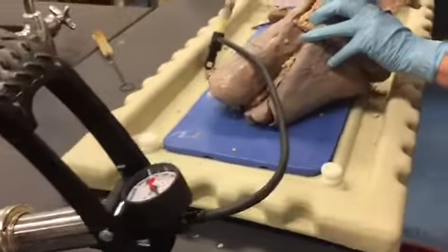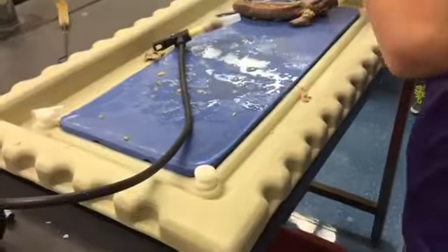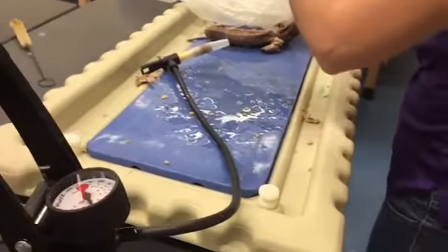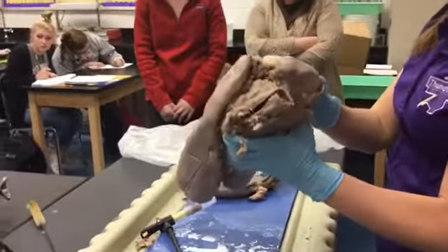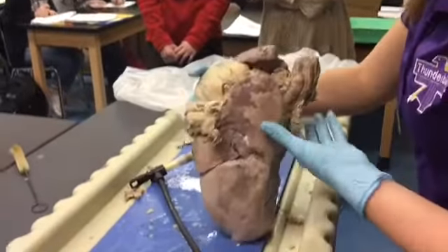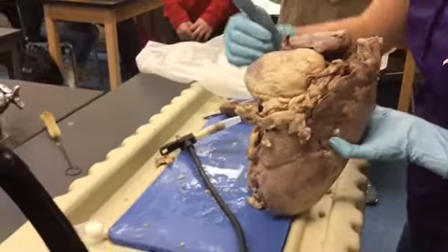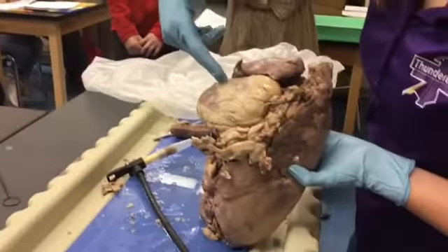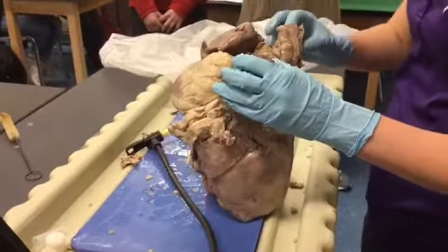In terms of vessels, I'm not going to dissect this too much, but you actually have something called your mediastinum, which is right in here. It's this protective layer, kind of a connective tissue surrounding it. Your heart is right here. We haven't done the chambers of the heart yet, but you'd have your left side right here, the right side over here. Here's a coronary artery delivering blood.